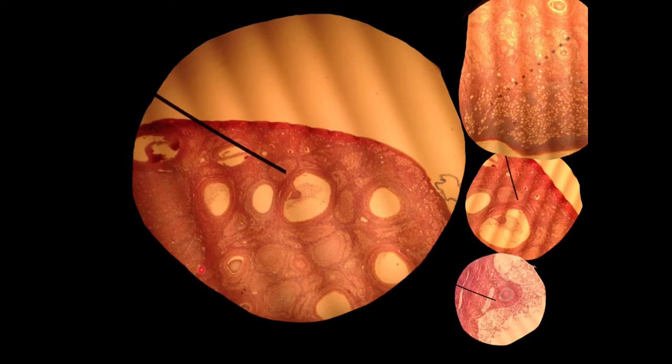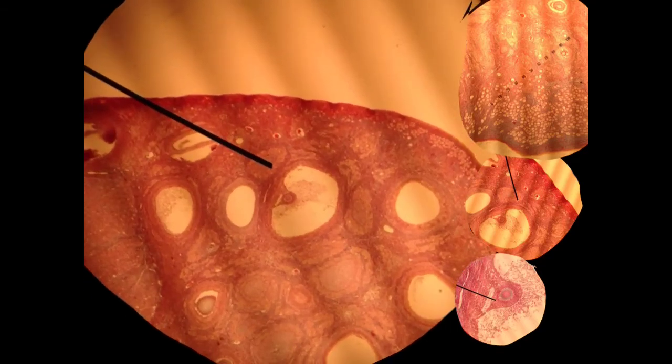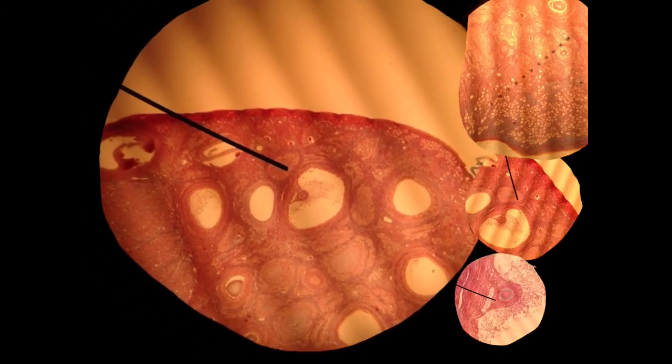The follicle actually turns into this really awesome endocrine tissue that produces progesterone. But what we're going to look at mostly in this video is the follicle development. In this large picture right here, you can see right in the middle, hopefully clearly, a Graafian follicle. We know it's a Graafian follicle because it has this large open space, this very large antrum. You can see the oocyte right in the middle, and around that oocyte you can see the corona radiata.